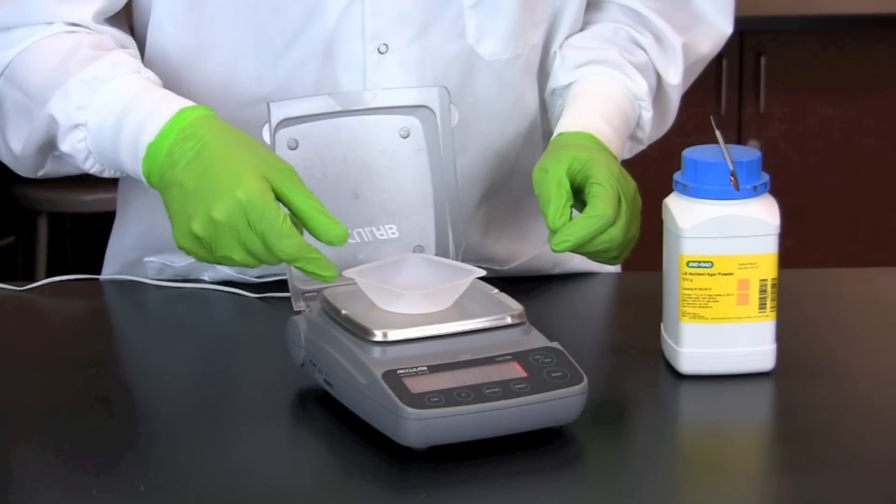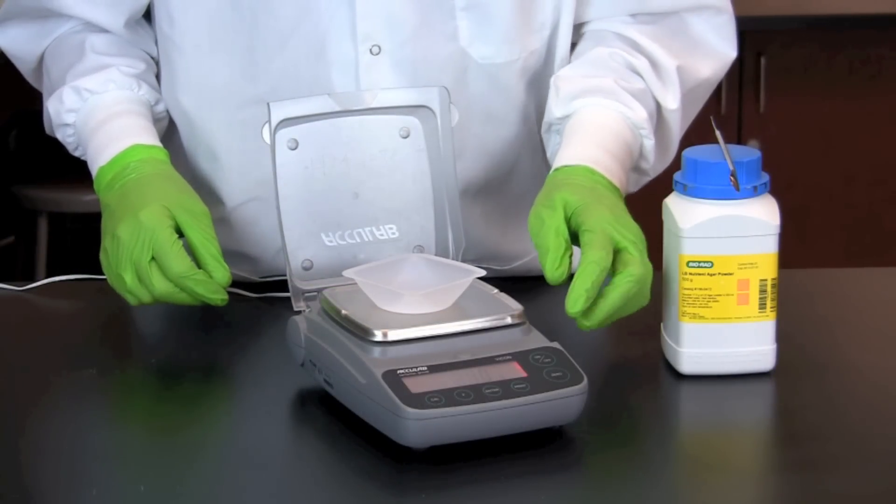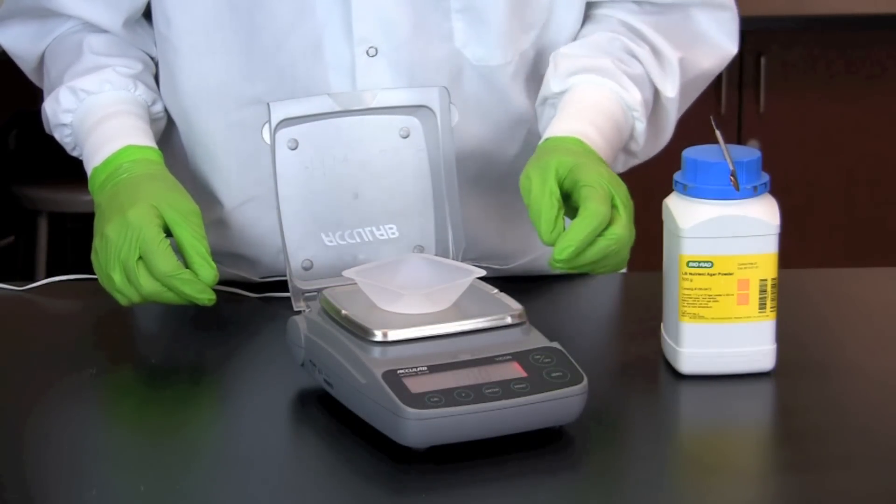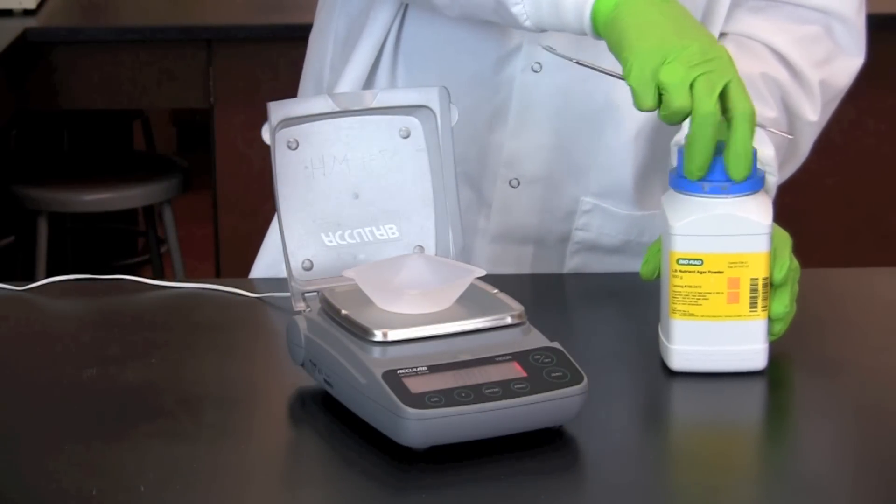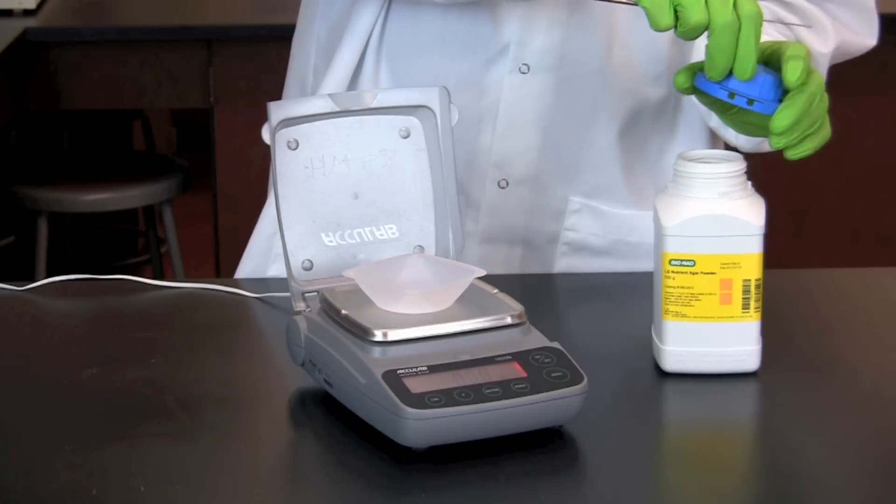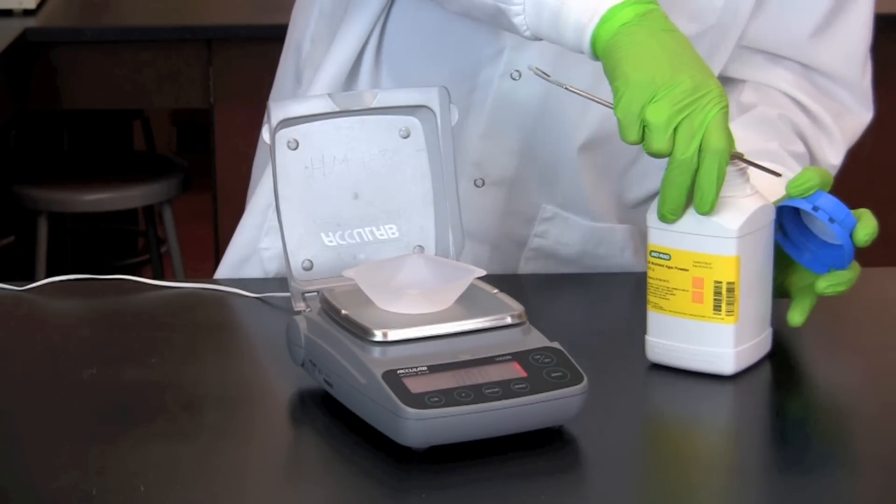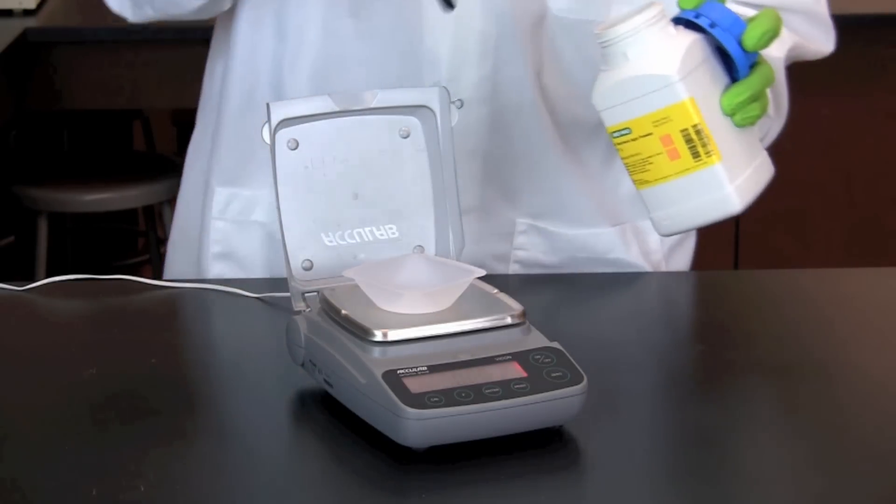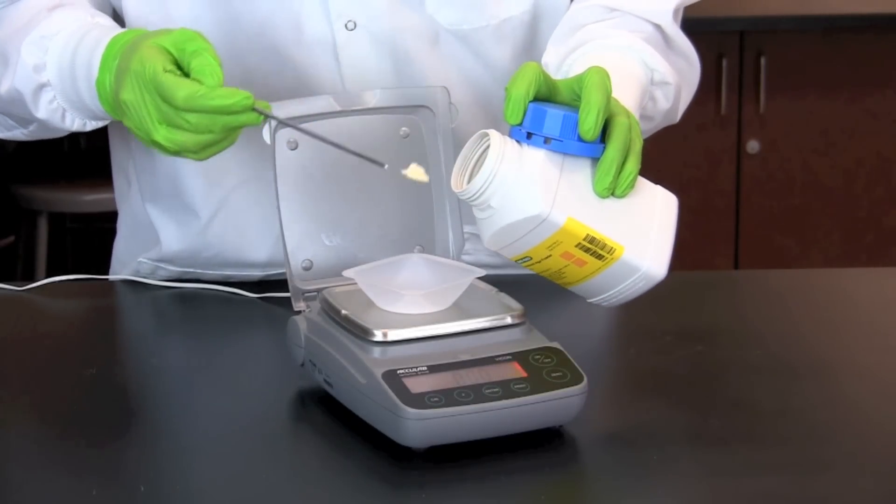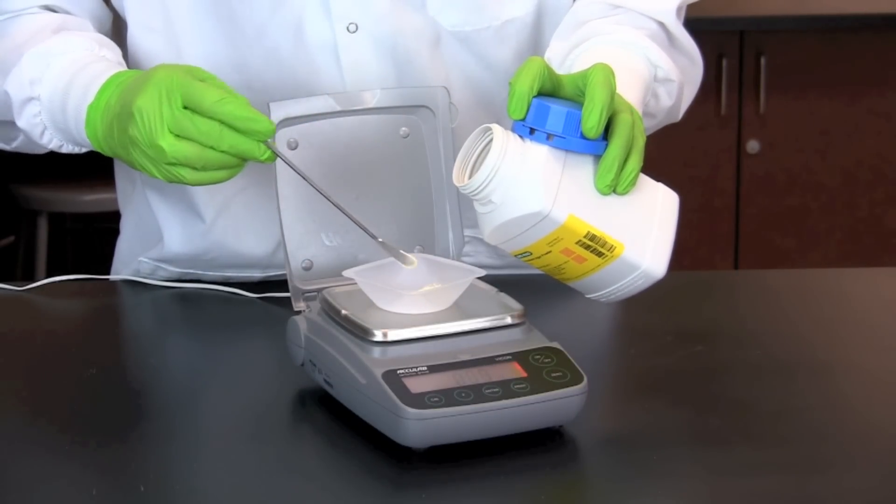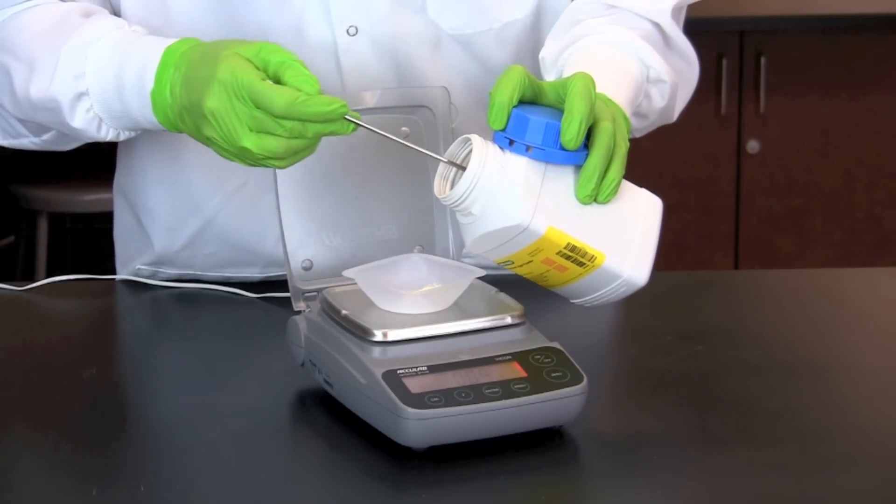Using an electronic balance, we place a weighboat on the weighing platform and zero the balance. We then add LB agar powder slowly using a clean spatula until the proper amount is reached.